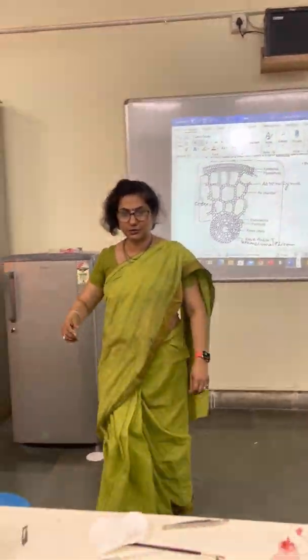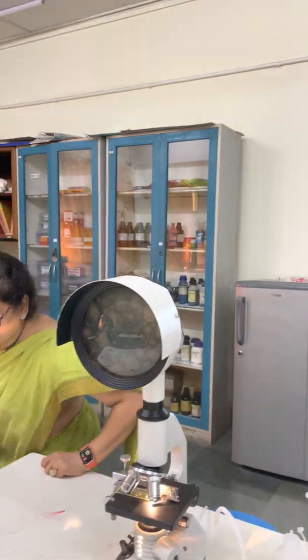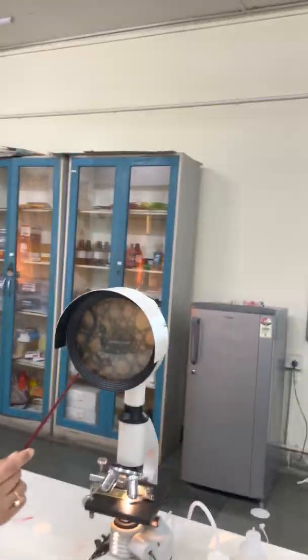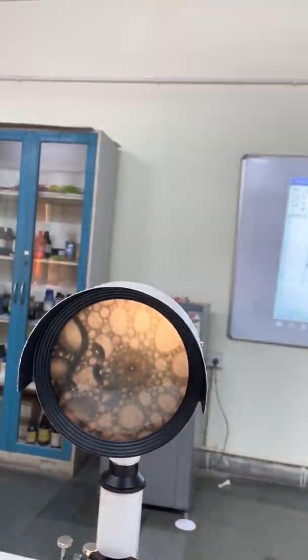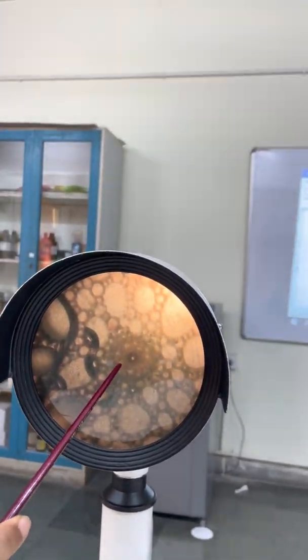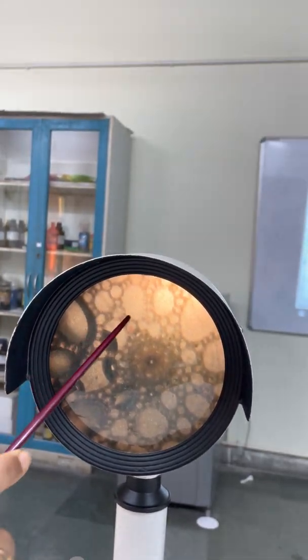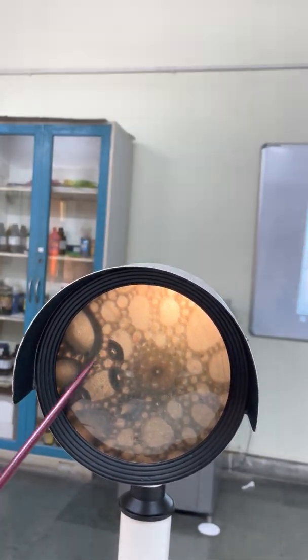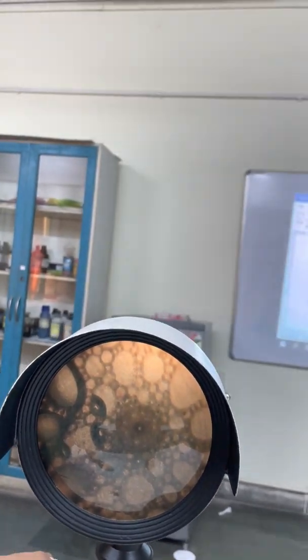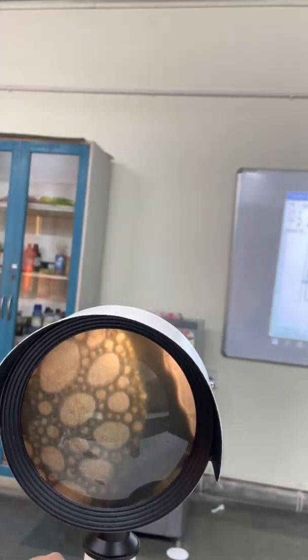I will show you in this microscope. You can see very well the slide which we have prepared. The xylem is reduced in the center, and this phloem is very well developed. You can see lots of aerenchyma — the air chambers — and if you move it slightly, you can also see the epidermis and the hypodermis.